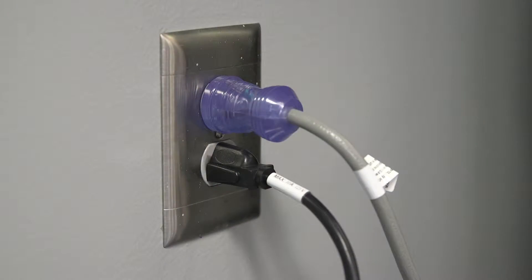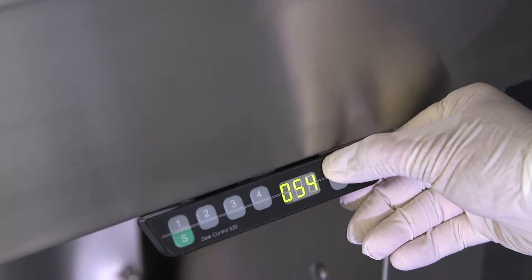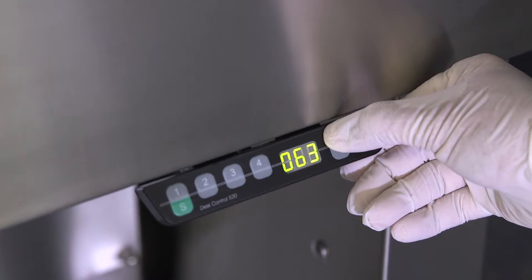The Versaflow should be plugged into a standard three-prong electrical outlet. This ensures that the equipment is properly grounded. The electrical height adjustment requires its own power receptacle and a 15-amp circuit.